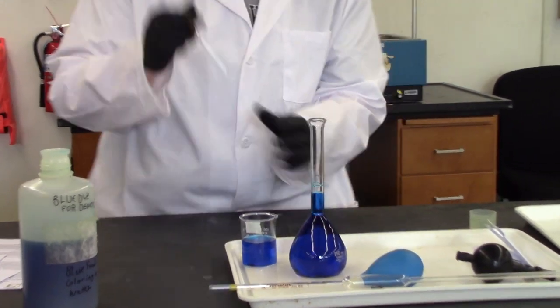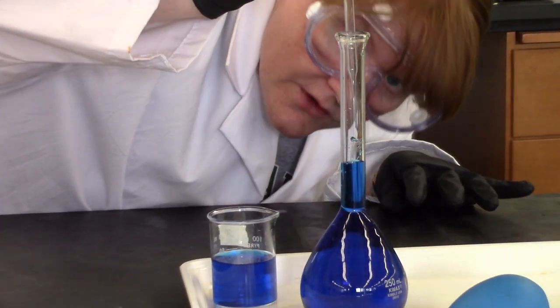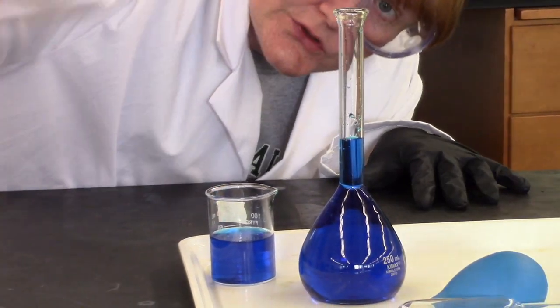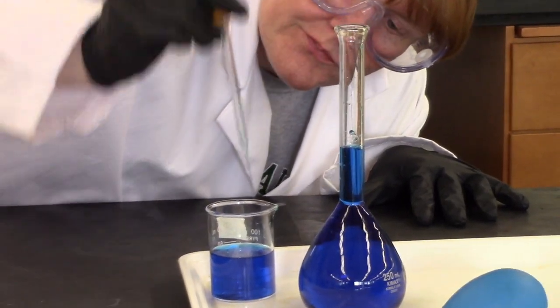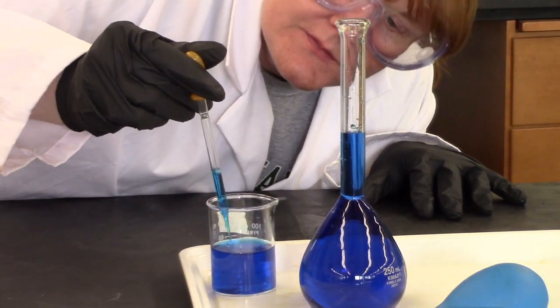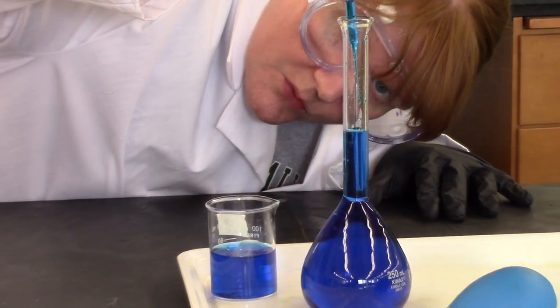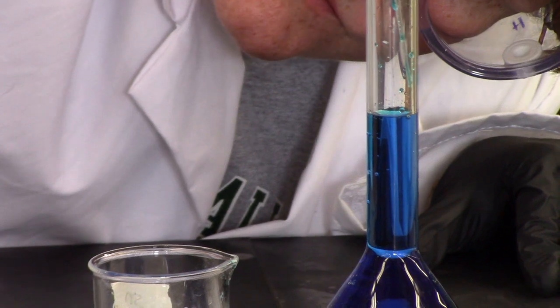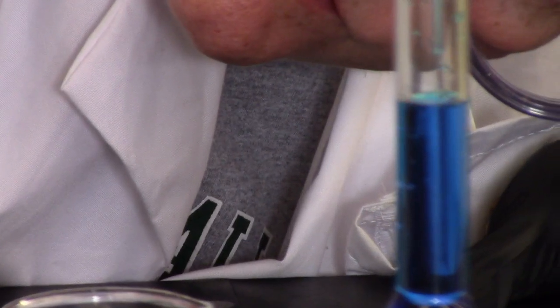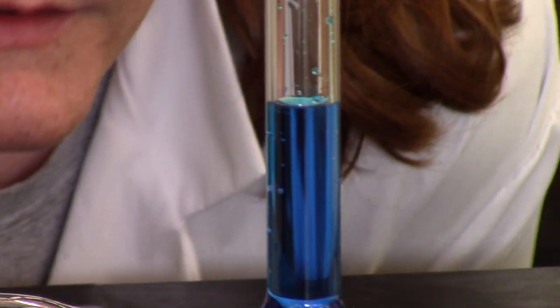Okay, so I have a bubble, I'm just gonna pop it. So what I'm gonna do is just take some pipette, and I wanna get down on the eye level so that that etched mark no longer looks like a circle. And you just keep adding, okay? I'll show you what this looks like with a background in a second. Okay, and so once you get close like this, you wanna add what they call drop-wise, which means one drop at a time. Not quite there. I think I'm going to do like two more drops.